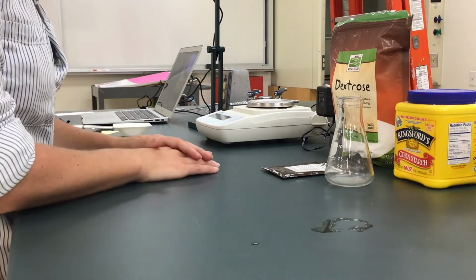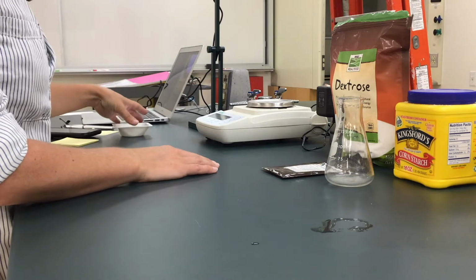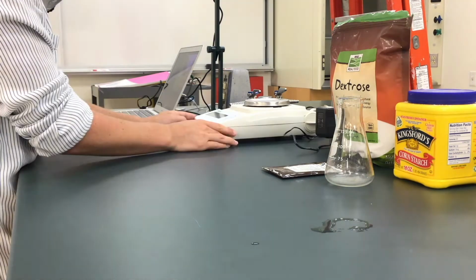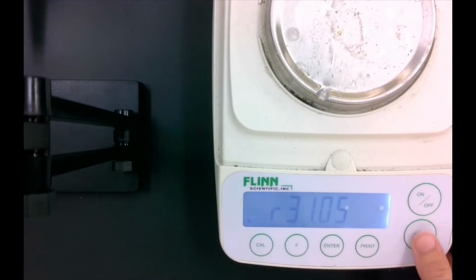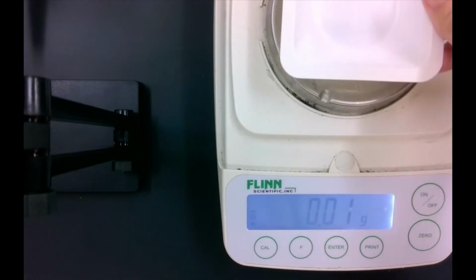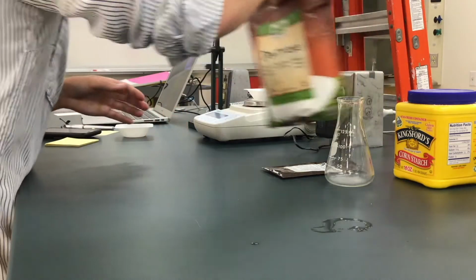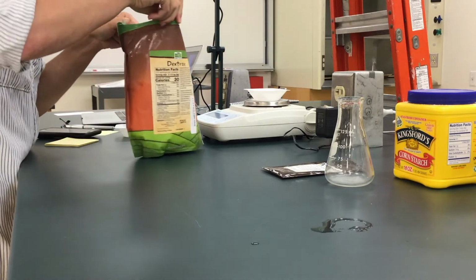So I'm going to prep that solution first. And what I'm going to need to do is to use our scale to measure out our material. So we're going to start with dextrose, or glucose, I should say.